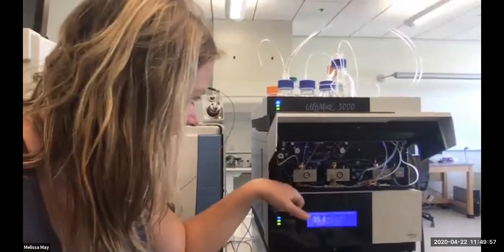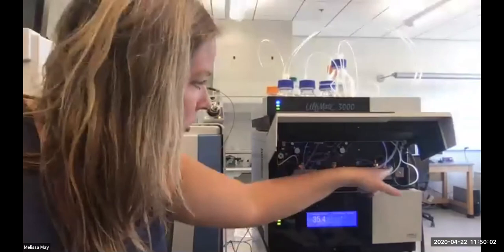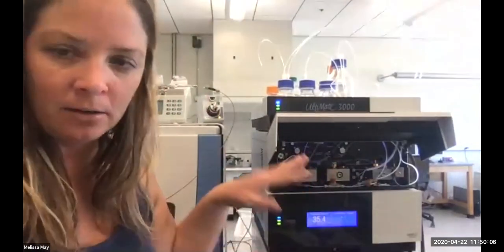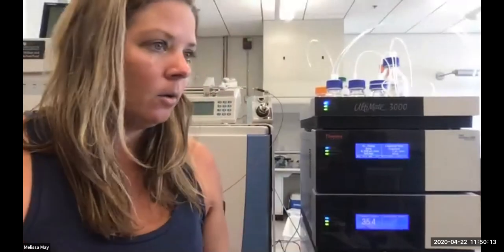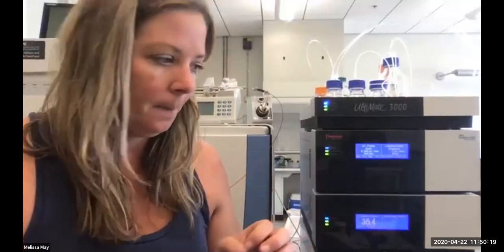But it's always a good idea before you run anything to make sure that there's no bubbles in your system. Make sure that nothing in here is leaking and that nothing in your other columns is leaking as well. If you do that, you should get pretty good flow going through your system, and it should be pretty easy to set up a stable spray so that you get good chromatography when you're doing your MS. So that's how that works.